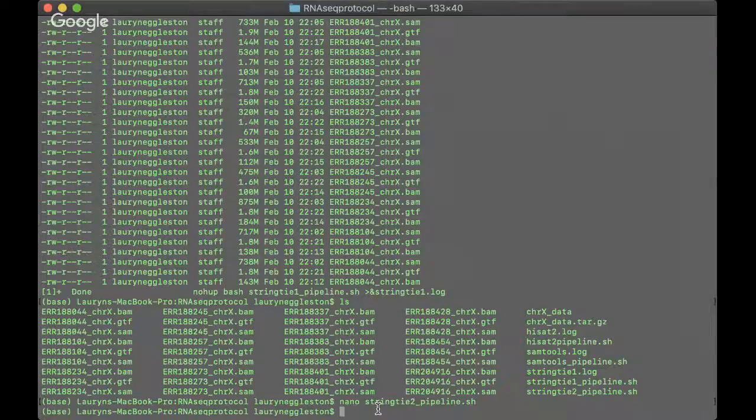Okay, so first, in order to even get to the part where we estimate transcript abundances and create table counts that will be used in Ballgown, first we have to merge all the transcripts that we have created, and that's just a command.